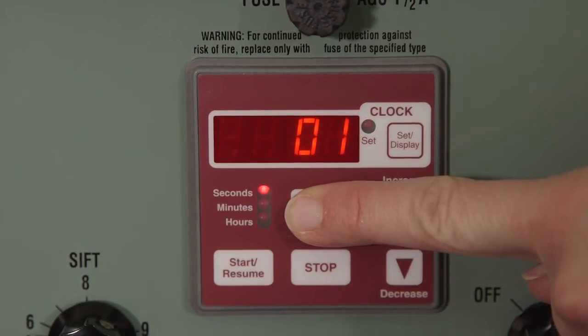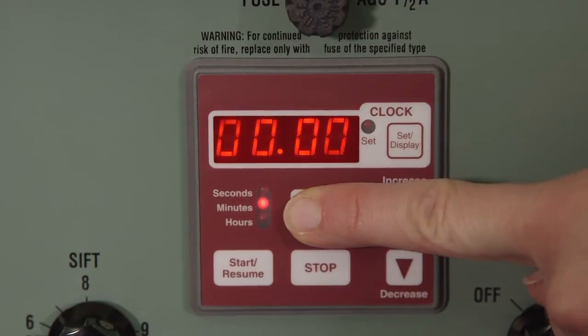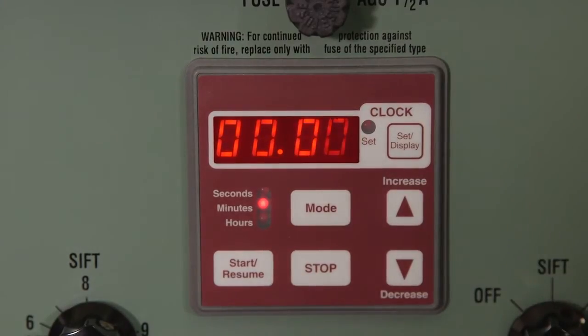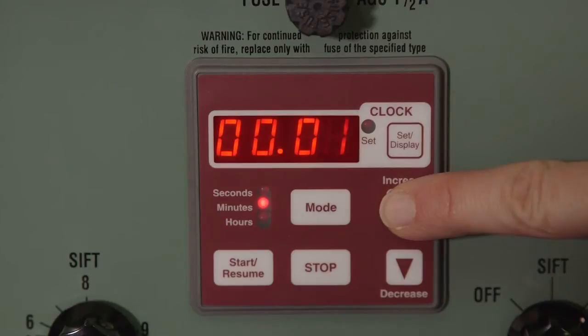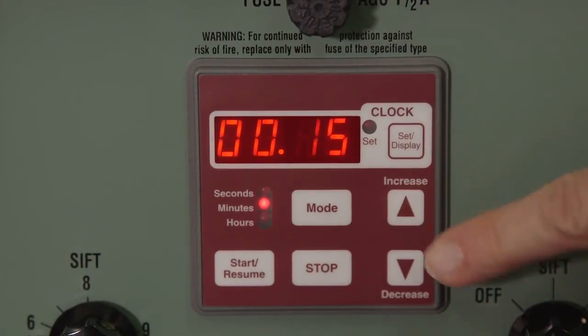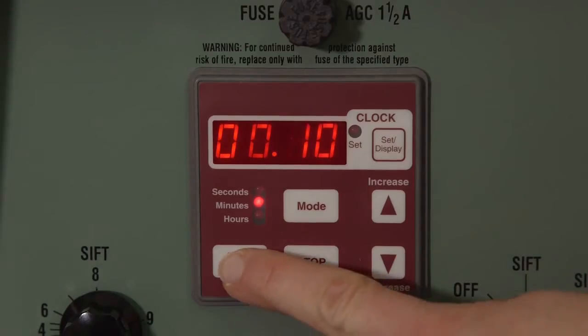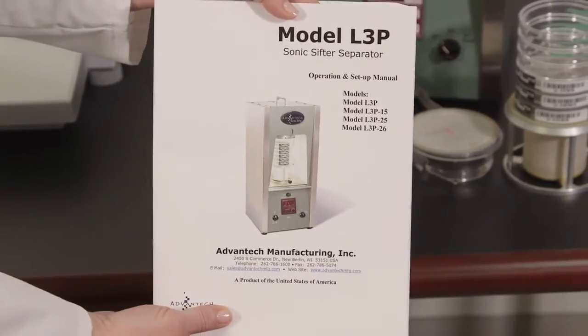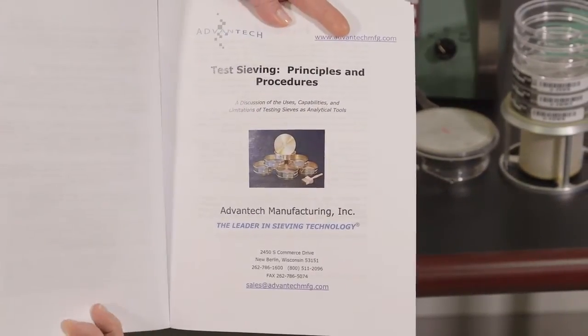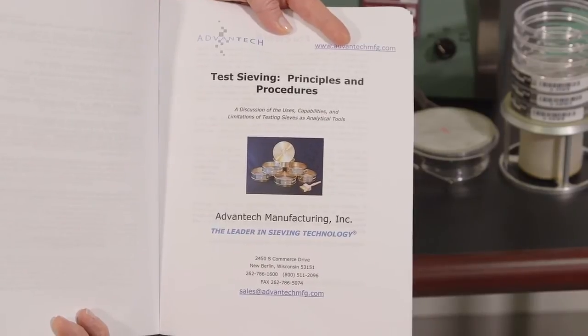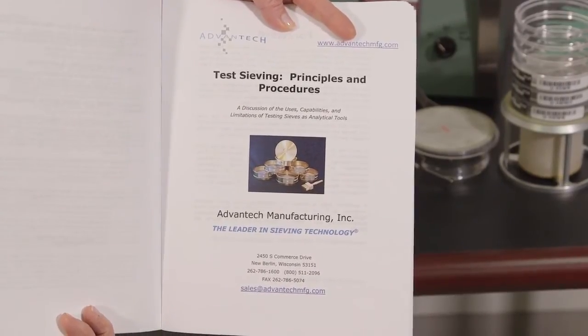Press and hold the mode button for one second. The LED will illuminate which mode is engaged. Set your countdown value by using the increase-decrease buttons. Once your time is set, hit start. If you are unsure of how long your test run should be, refer to our Test Sieving Principles and Procedures Manual located in the back of your operation manual or found on the product info page of our website.